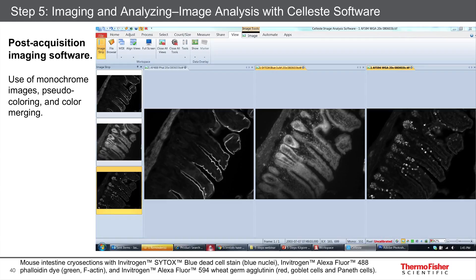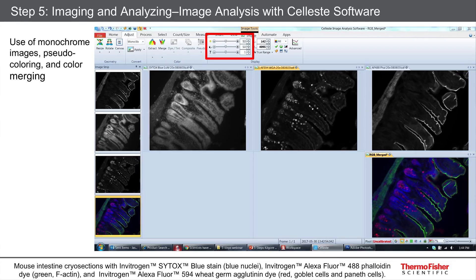There are certain characteristics that you need to keep in mind when considering optimized publishable images. Here I've pulled up a three-color image where I've taken each of three colors — blue, green, and red — in monochrome 16-bit images, and recolorized it using the merge feature. You can see in the lower right the colored version with all three colors. But there are some things you can change, and maybe not in a good way. On the upper part of this image in the red block, you can see that I can adjust the brightness, the contrast, and the gamma. It's okay to do that in some circumstances — maybe you want to bring out certain features for the reader of your paper — and that's fine. Just realize that you're changing that picture in ways that may not be ethical, so you have to make any changes very judiciously. I'll talk in a minute about the ethics of imaging.